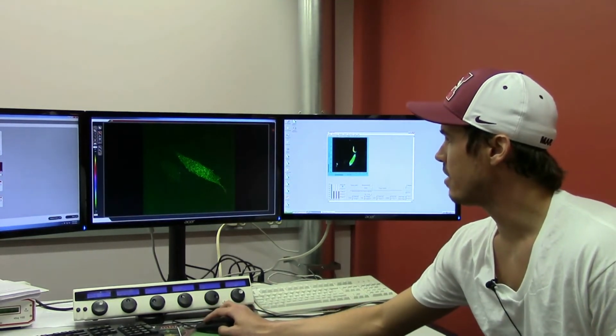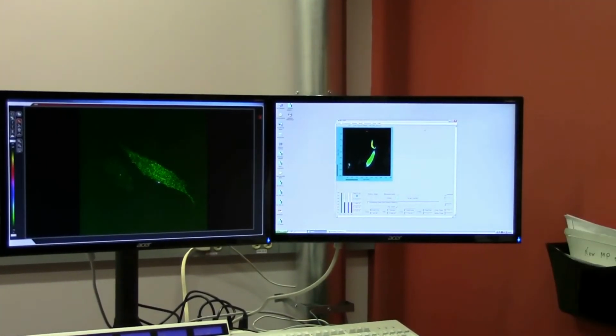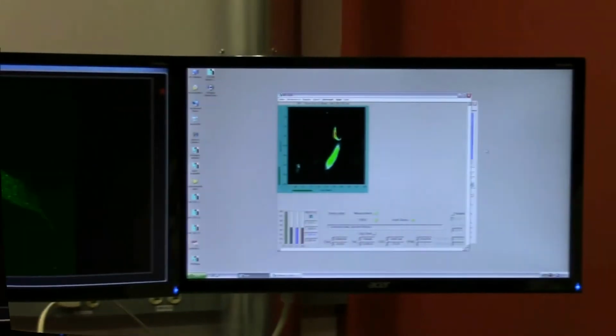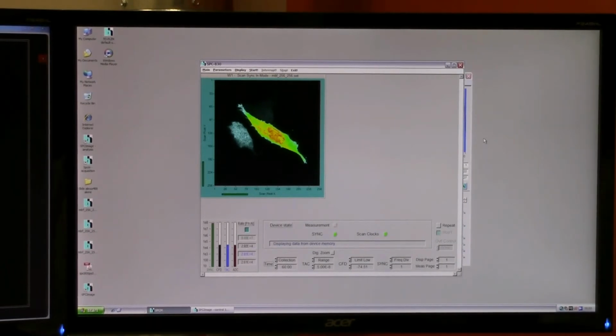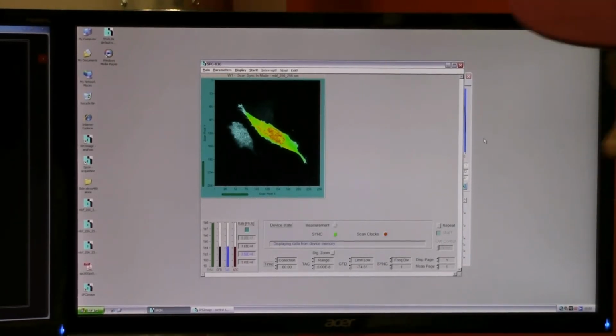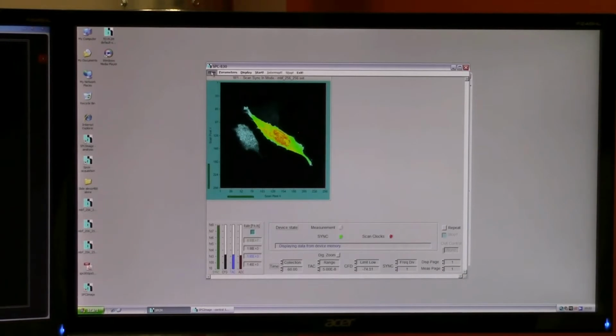We see that the intensity of our pixels corresponds to the green as I described, and we shouldn't be getting any bleaching occurring here. Once we feel comfortable with our field of view, we'll go over here once again and press Start. We have a 60-second acquisition time. Following 60 seconds of acquisition, we'll stop our scan here. And as you see, we've acquired our cell. And once again, we're going to go ahead and send this to our analysis program.